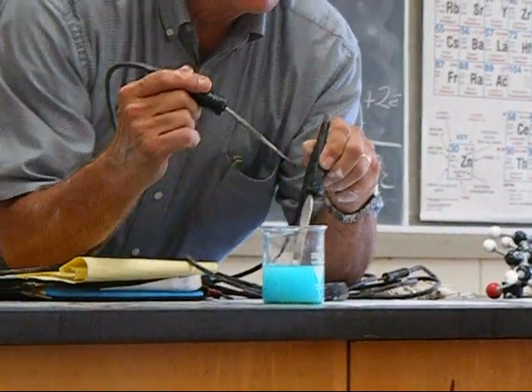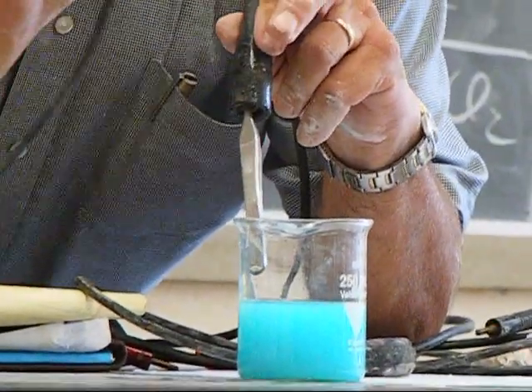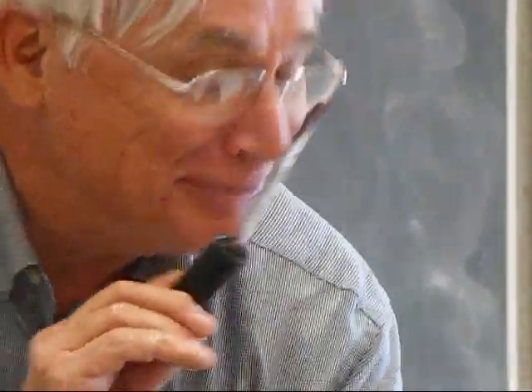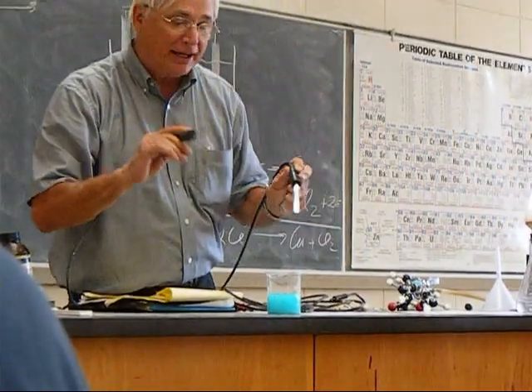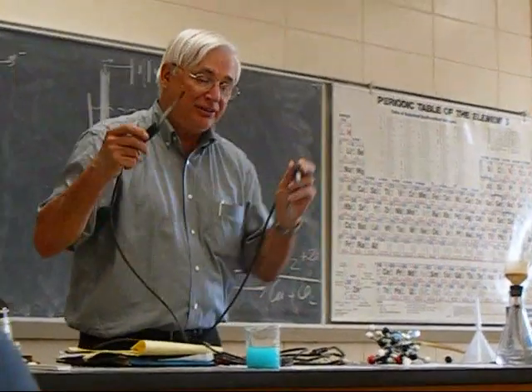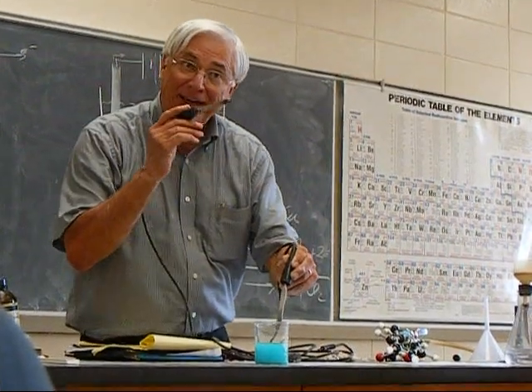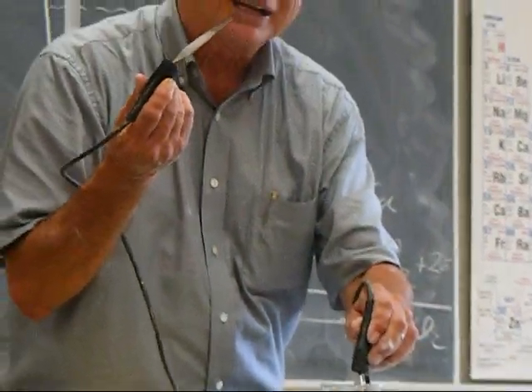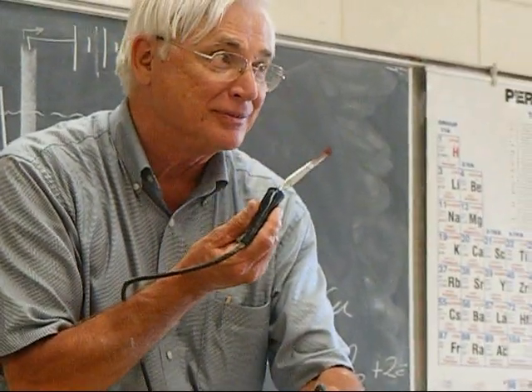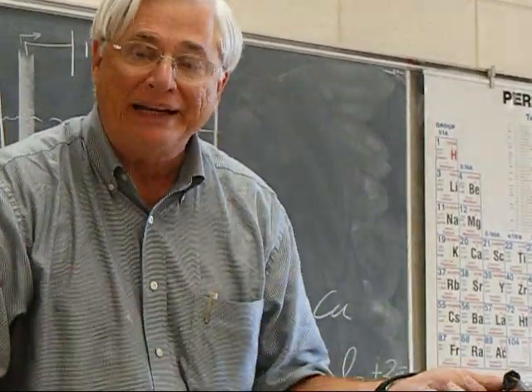Now notice, I'm electroplating some copper on there, do you see that? Isn't that amazing? If this were a solution of gold chloride, and I have an iron necklace here, put it in there, electroplate it — that's what they do. I've got a coat of copper metal. You'd have a coat of gold. It would be electroplating. We're electroplating something.